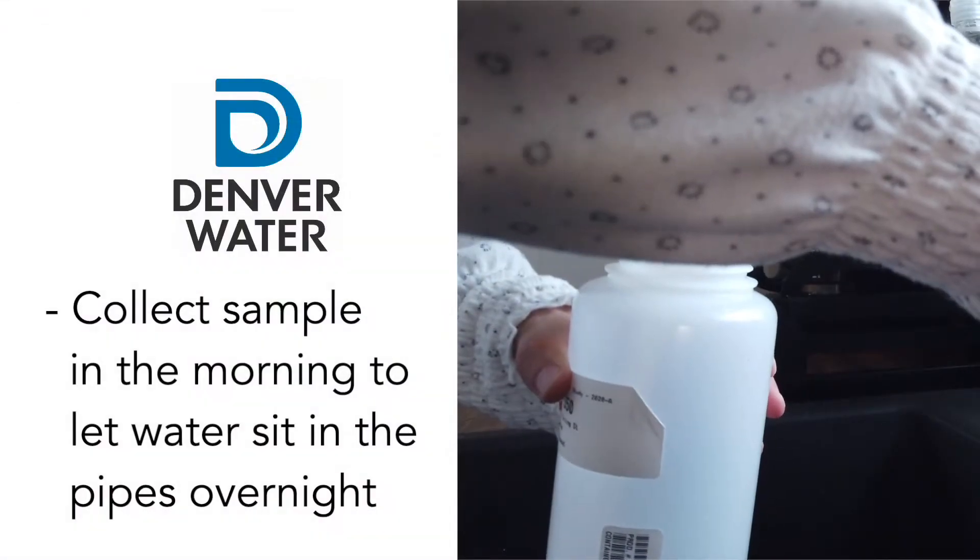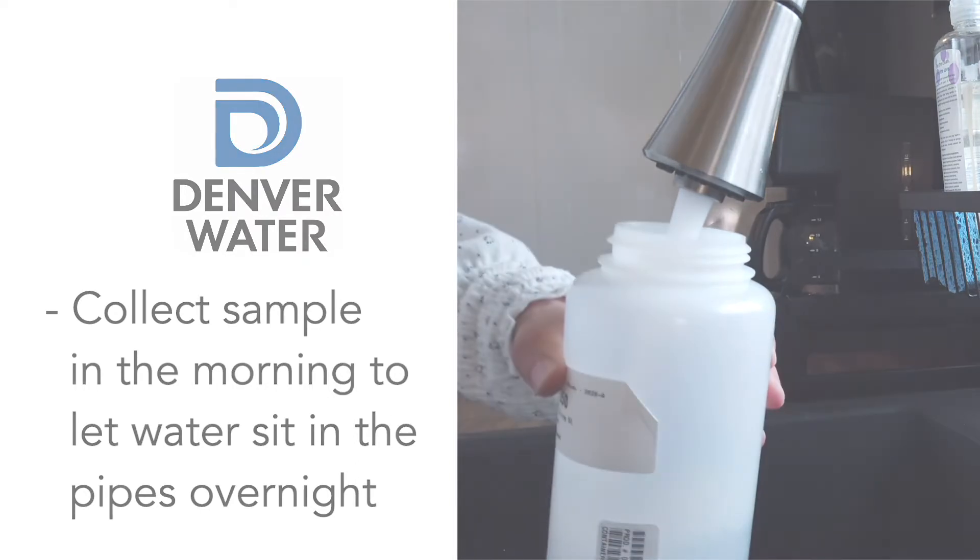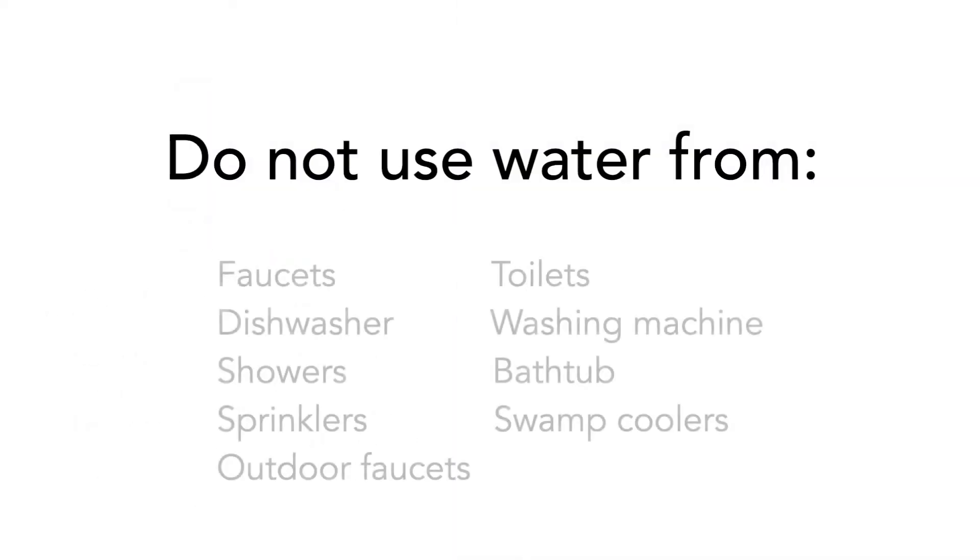We recommend collecting your sample first thing in the morning, after water has been sitting in the pipes overnight. During this stagnation period, it's important that you do not use any water in your house and make sure all your sprinklers are turned off.